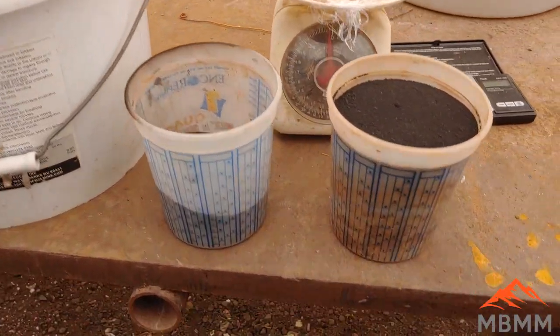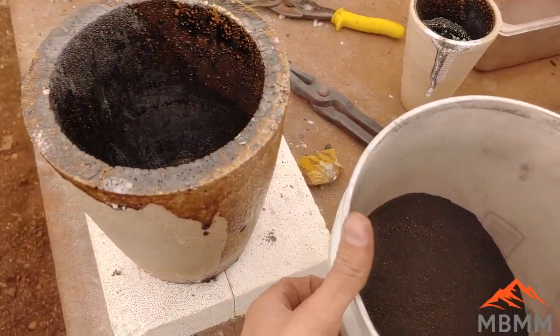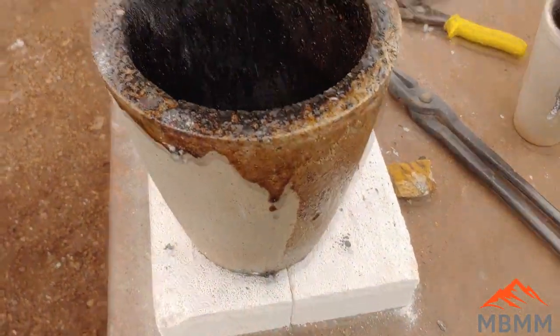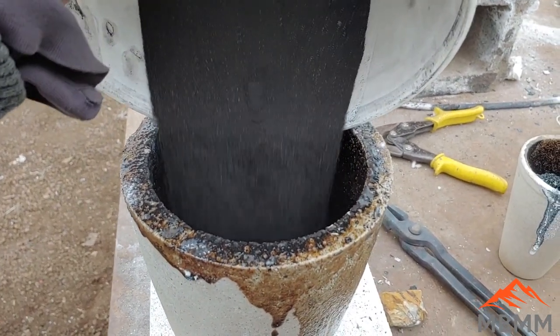Here's the flux we're going to be using: this is Chapman's flux. It's mostly borax, soda ash, and silica, with a little bit of manganese dioxide as an oxidizer. I've mixed up about two kilograms of Chapman's flux for the one kilogram of roasted ore that we have, and I'm going to smelt them in this number 12 crucible.